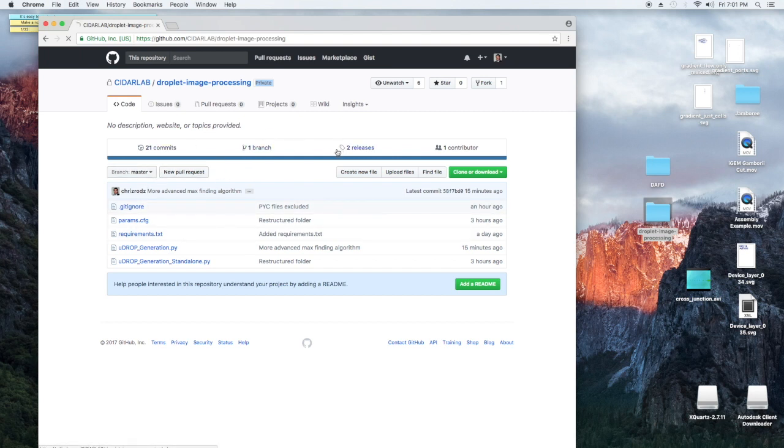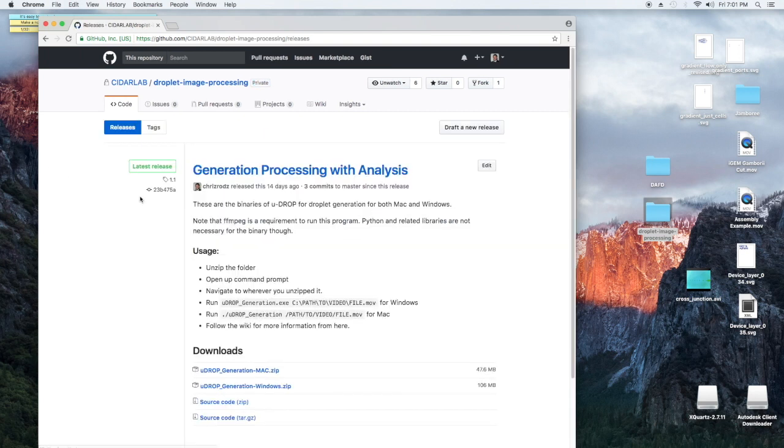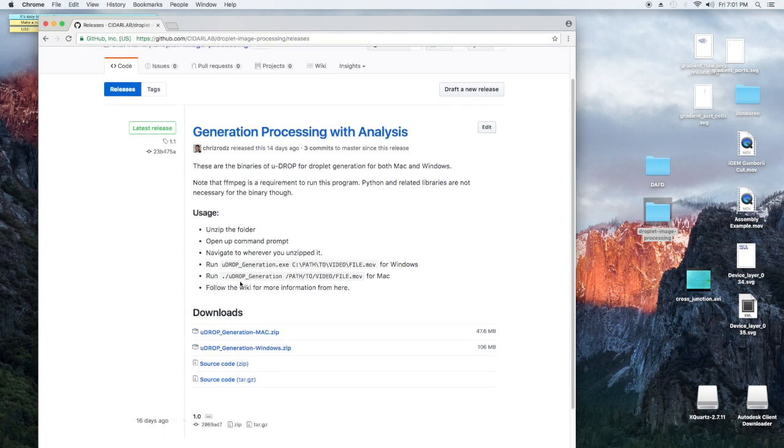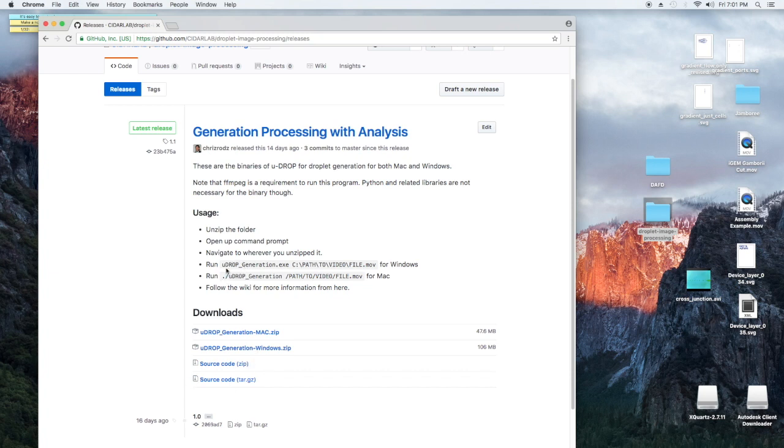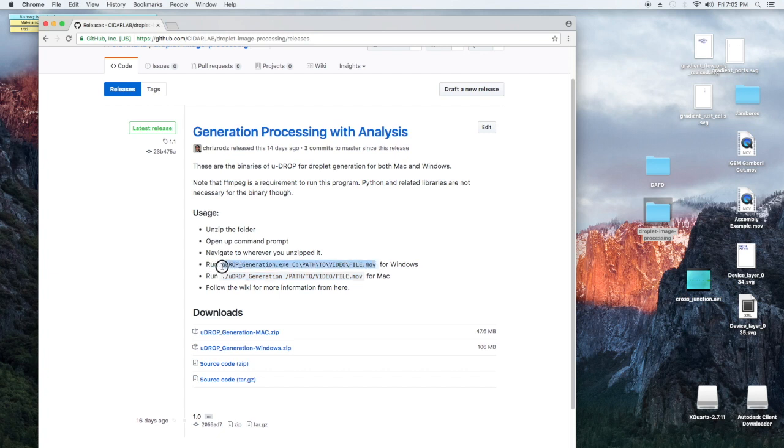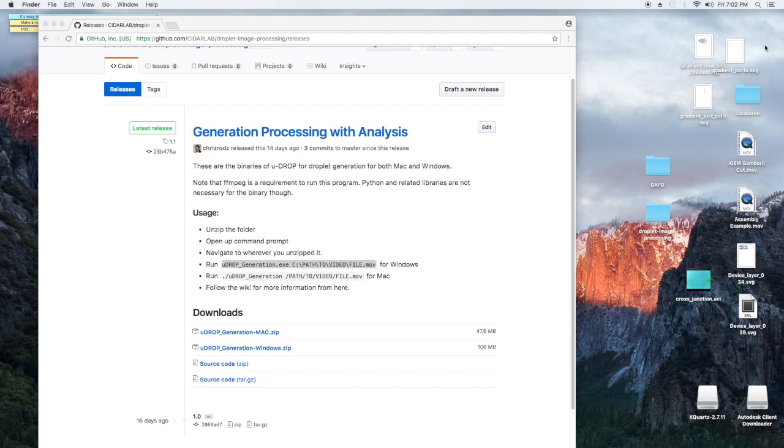So let's go to releases. You're going to want to download the zip for Mac if you're running Mac and Windows if you're running Windows. I'm going to be running on the Mac version, but the only difference should be instead of running this line, if you're on Windows you're going to be running this line, but everything else should be the same. So we're going to download the zip, we're going to unzip it.